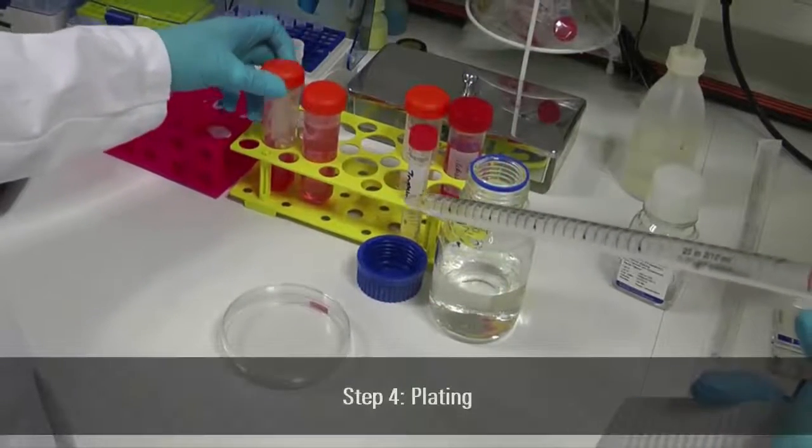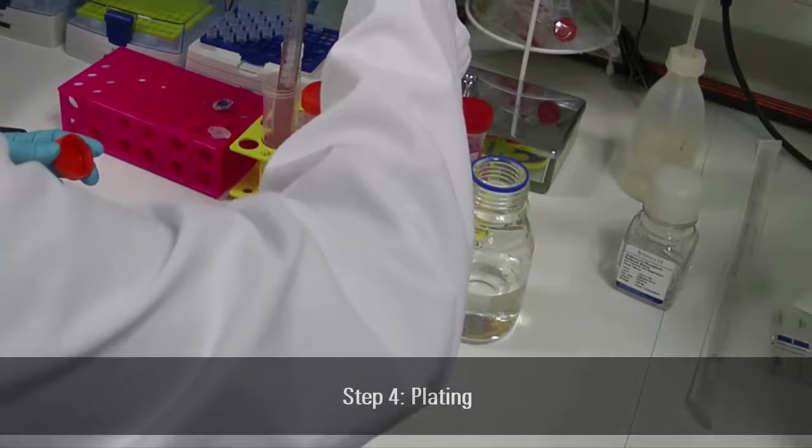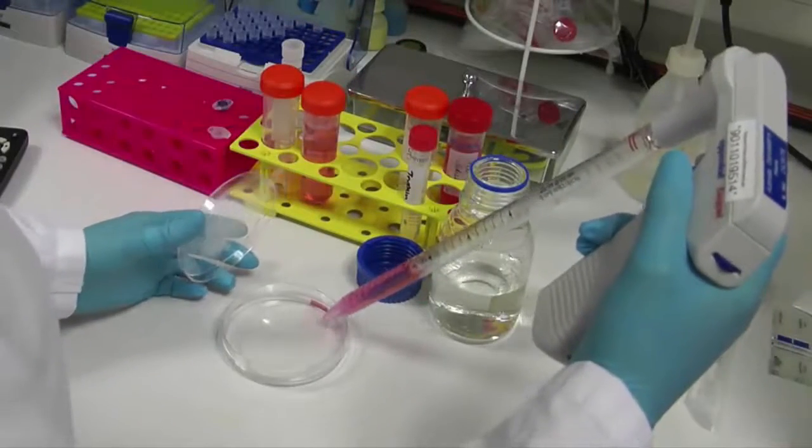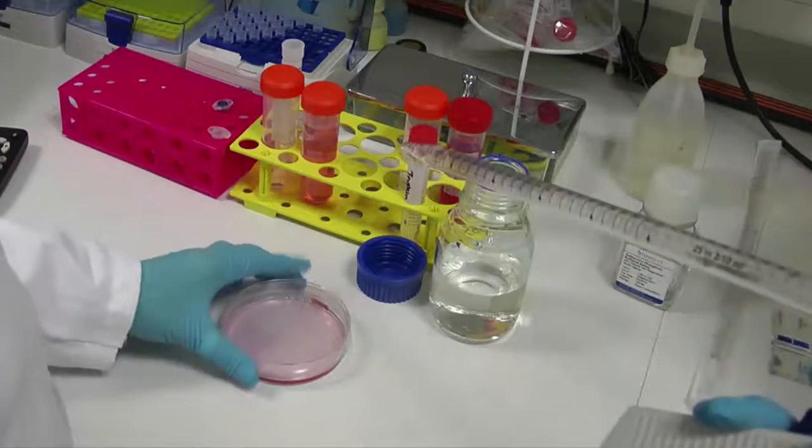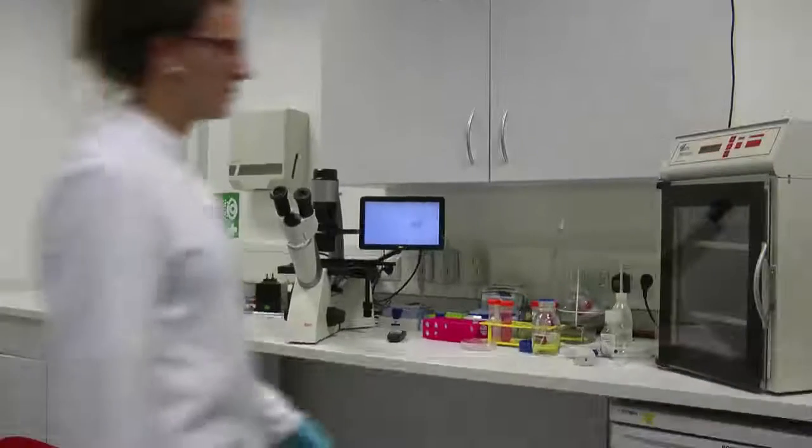Pipet the required volume of cells into new dishes at the required split ratio and top up with culture medium to the required final volume in each dish. Here we use the split ratio of 1 to 10. Leave cells overnight to recover and settle.